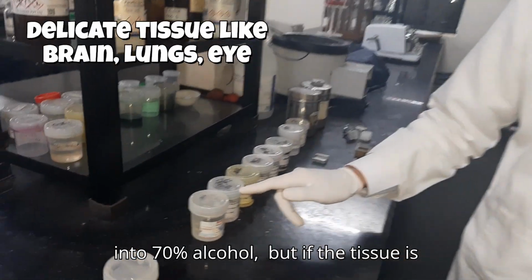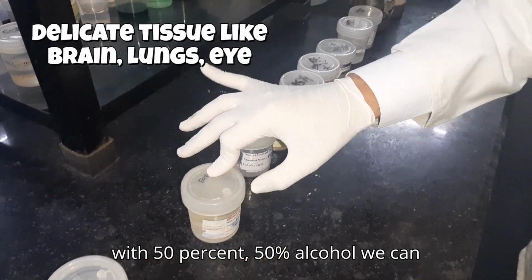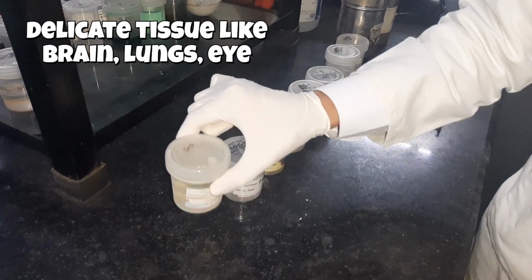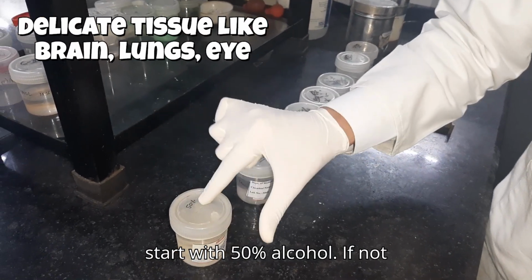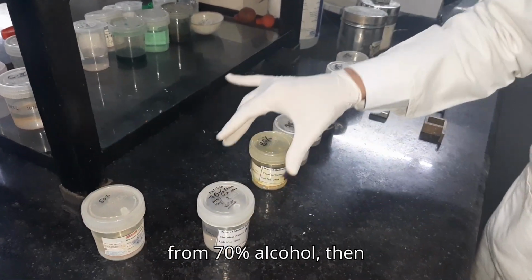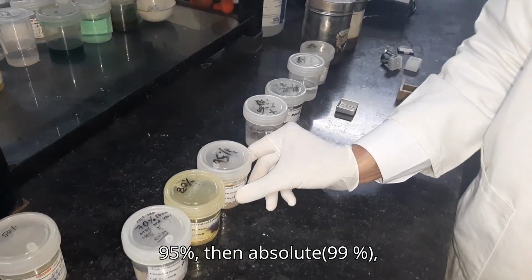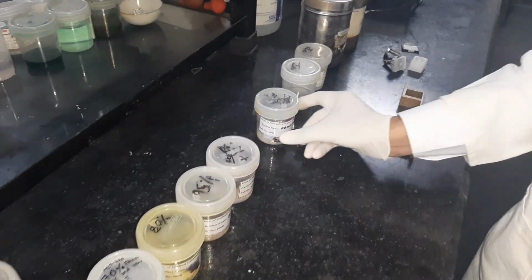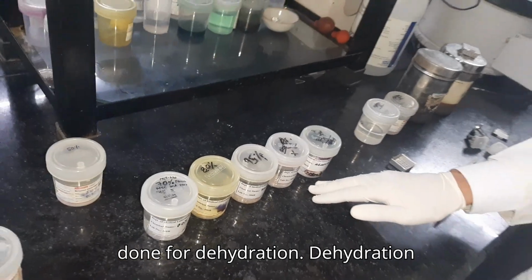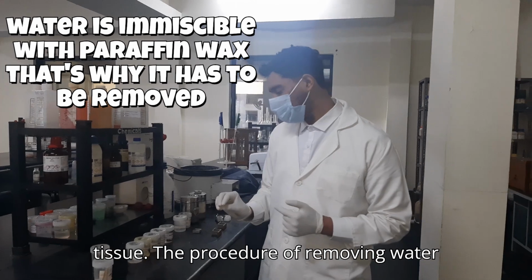After completing the formalin preservation, the tissue will be transferred into 70% alcohol. But if the tissue is delicate, we can start with 50% alcohol, like ethanol. If it is not delicate tissue, we start from 70%, then 80%, then 95%, then absolute, and again absolute. This procedure is done for dehydration. Dehydration is the procedure of removing water in the tissue.